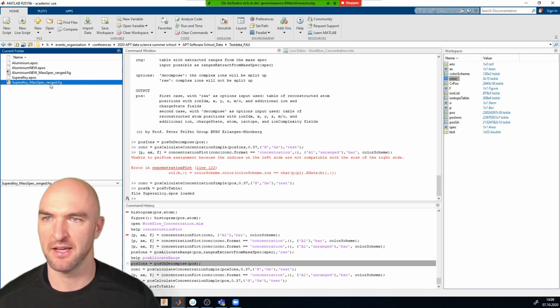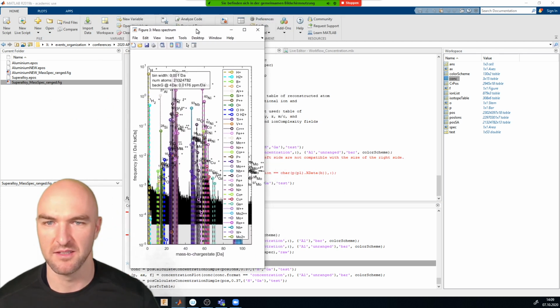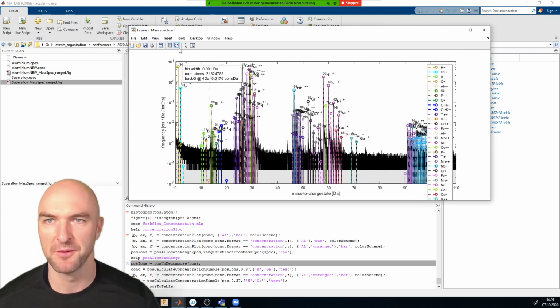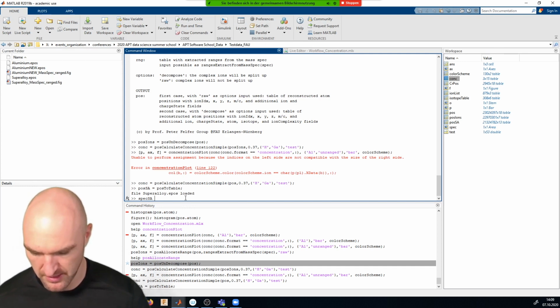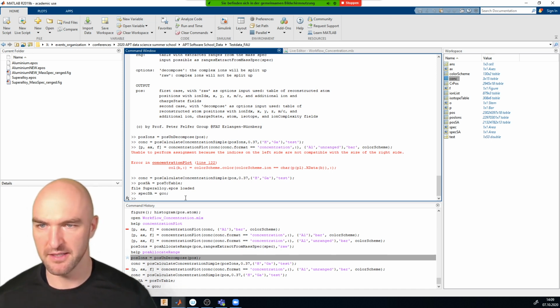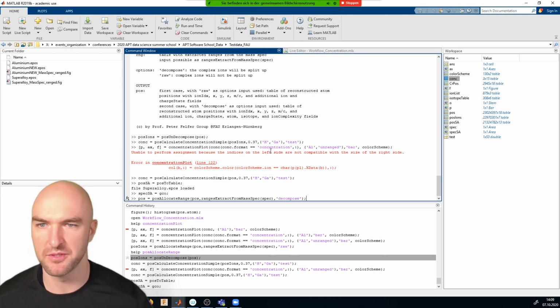Yep. And I'll open the mass spectrum ranges. So you can see for the superalloy, obviously there's a whole lot of peaks that are there, but they're all nicely ranged. And I will just click now on the spectrum itself and go spec SA equals get current object, and do the same decomposition with pos SA.